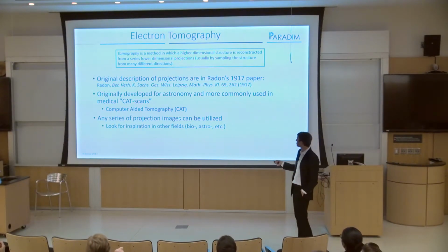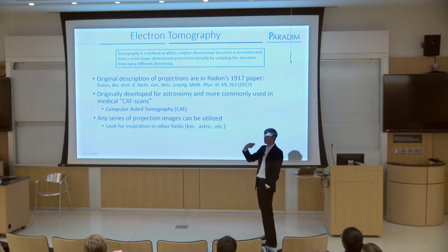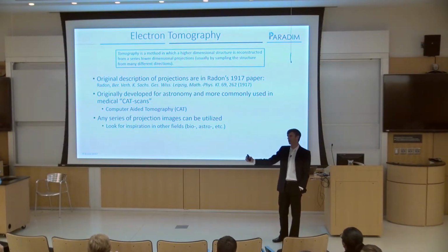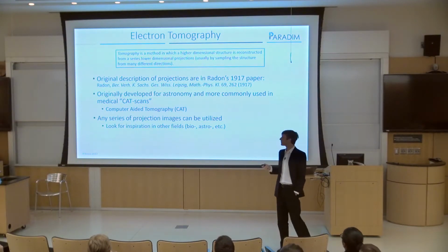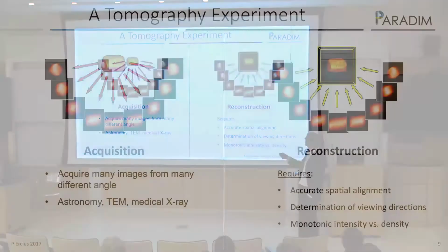So any series of projection images can be utilized. Okay? So you can look for inspiration in electron tomography, how to do reconstructions, how to do visualization, how to do segmentation, which are all these things we're going to talk about. You can look in many of these different fields. I'd say TEM is not as developed in tomography as some of these other fields. So there's a lot to be learned from astro, bio, medical imaging. The problem is medical imaging, they're all billion-dollar companies. They don't want to tell you what they're doing. But we're catching up.